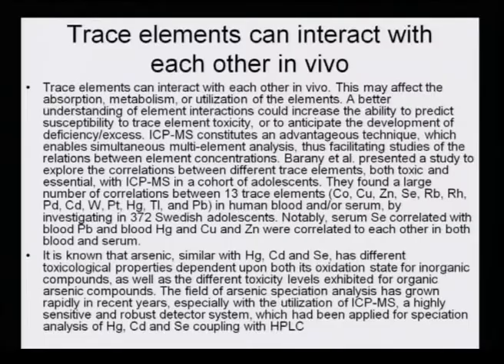So, many methods have either direct analysis on ICP-MS or the sample is first separated on LC or HPLC and then analyzed on ICP-MS. So, this kind of in vivo study also is possible for trace element detection by this versatile machine which is called ICP-MS.